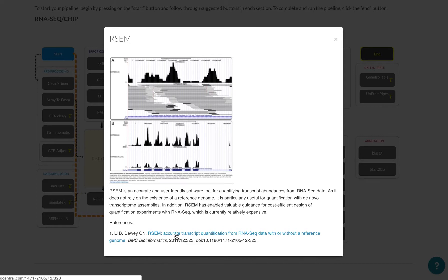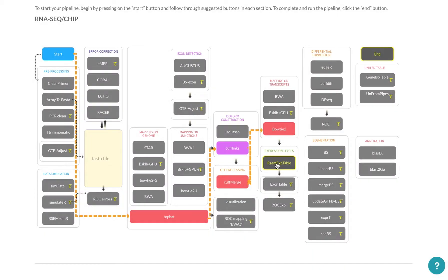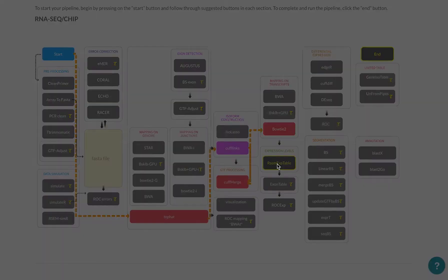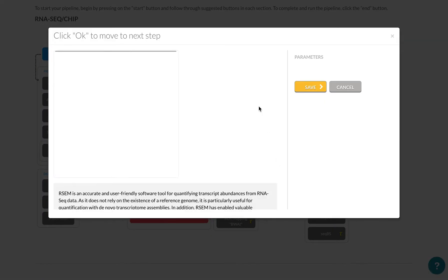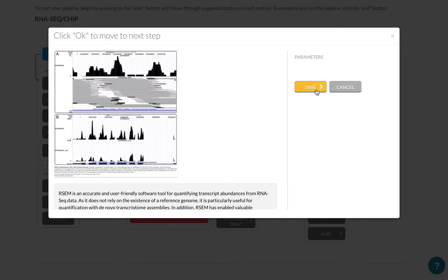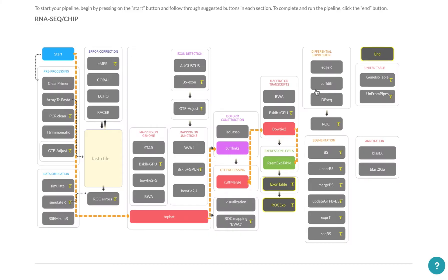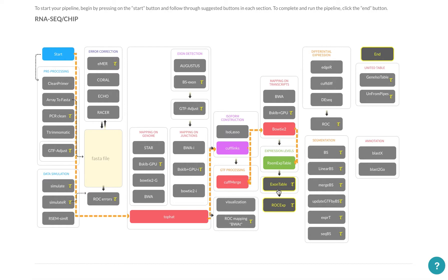So RSEM expression table, I'm going to use that. And I sometimes want to do an exon table. In this case, I'm not going to do that. So I'm just going to click end.